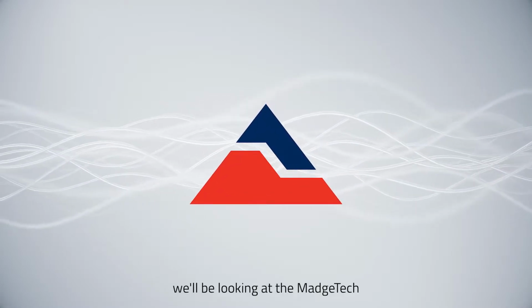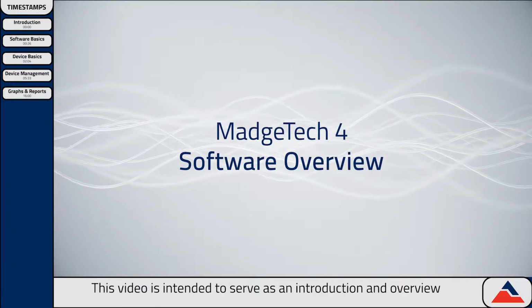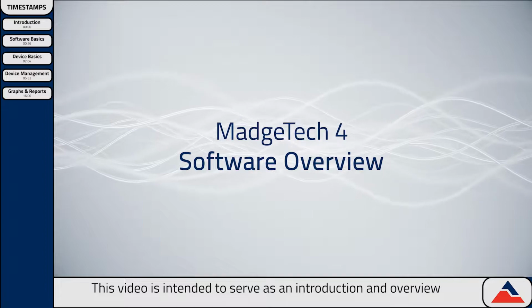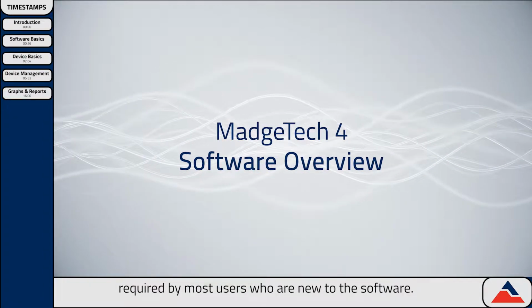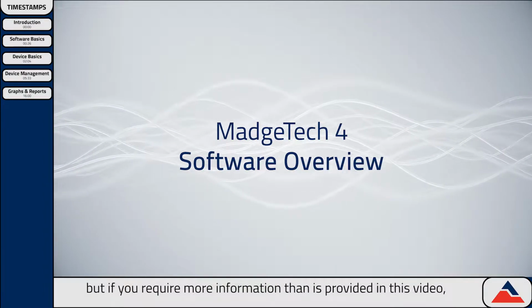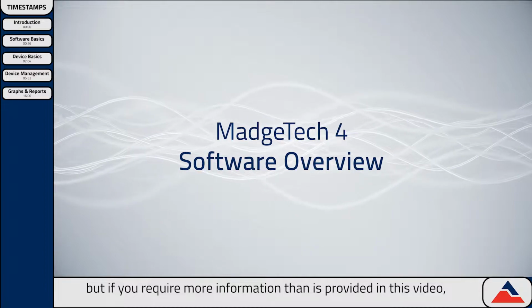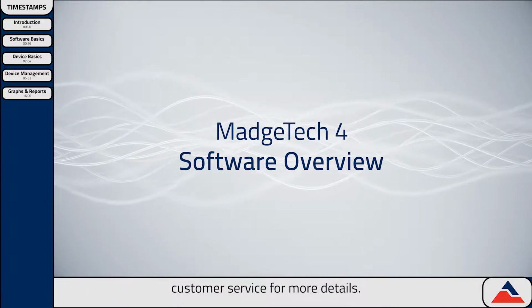In this video, we'll be looking at the MadgeTech 4 software, which serves as the heart of MadgeTech's workflow. This video is intended to serve as an introduction and overview of the basic features required by most users who are new to the software. Some of the more advanced or niche features won't be covered, but if you require more information than is provided in this video, please refer to your software manual or contact MadgeTech's customer service for more details.